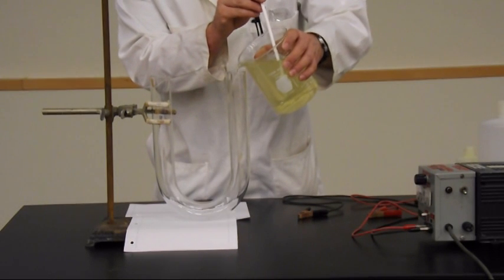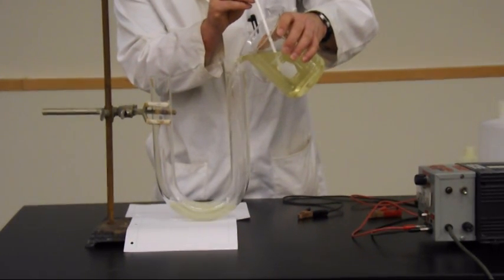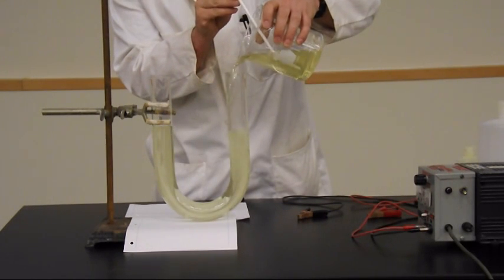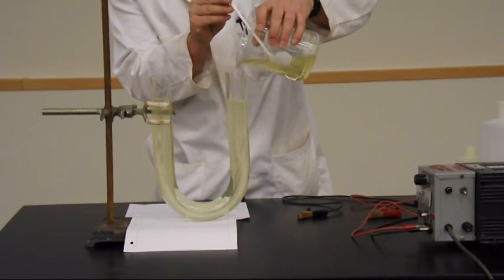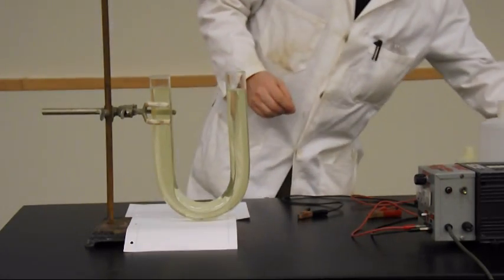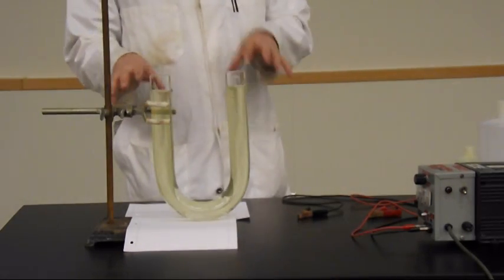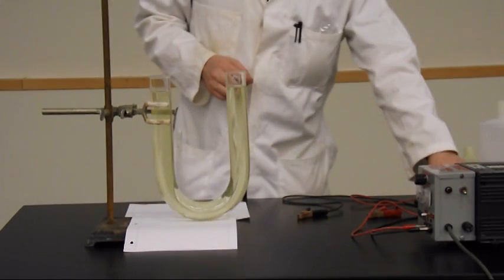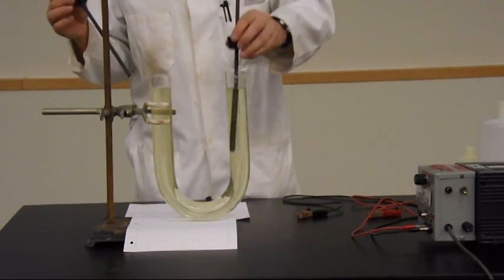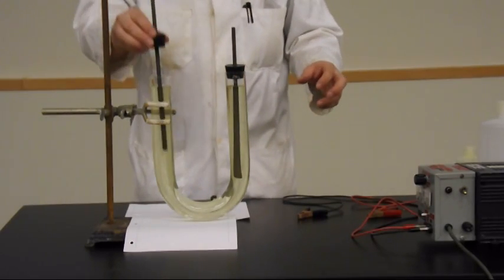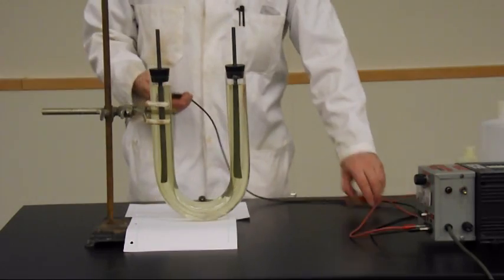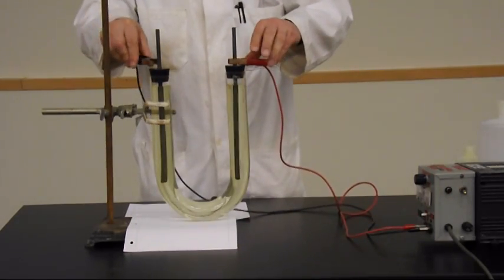I'm going to fill up my U-tube. It's slightly yellow because of a little bit of oxidation of the iodide. These are two graphite rods that I'm using as electrodes. They are both inert electrodes. They don't take part in the chemistry. They're just there to pass current.